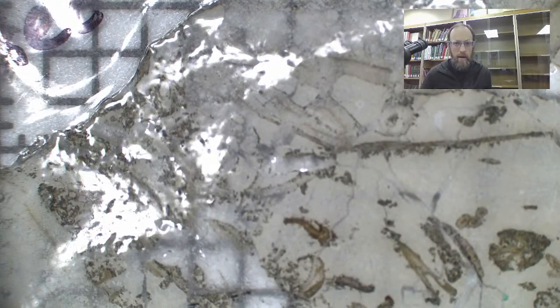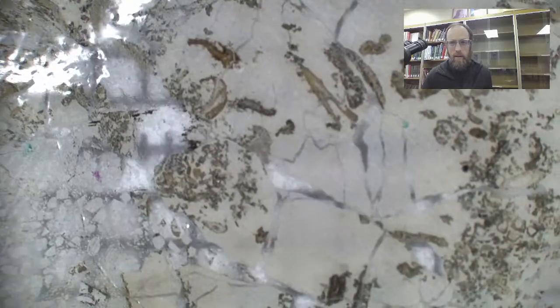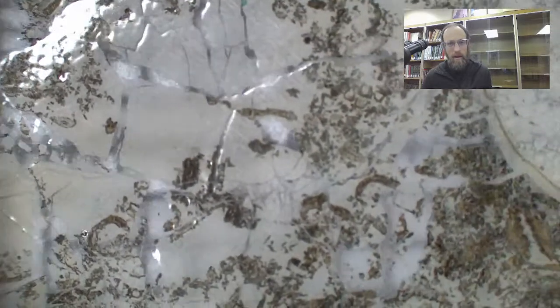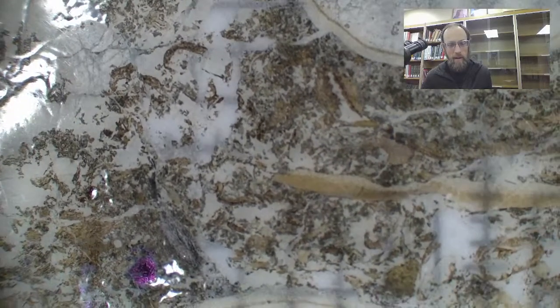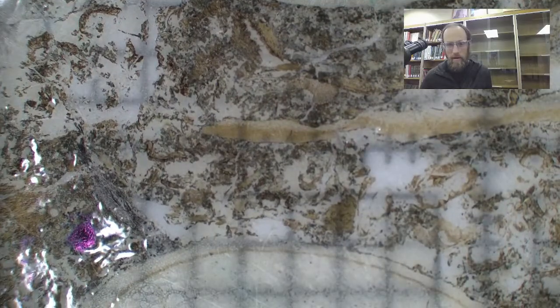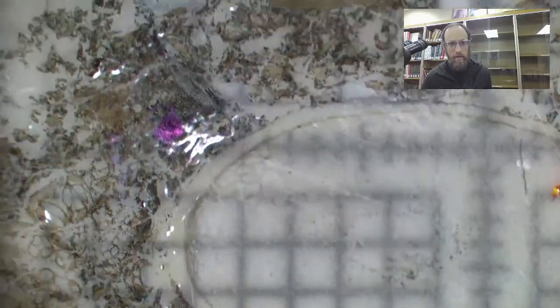Let me zoom out just a little bit. I always like this as an opportunity to talk about my subject, because that way I get better and better at describing it. So a coal ball is a carbonate accretion that occurs in a coal deposit, and as suggested, they're balls, they're not flat sheets like this.